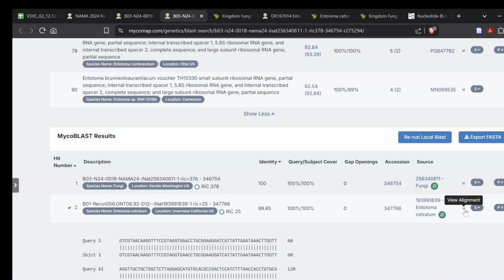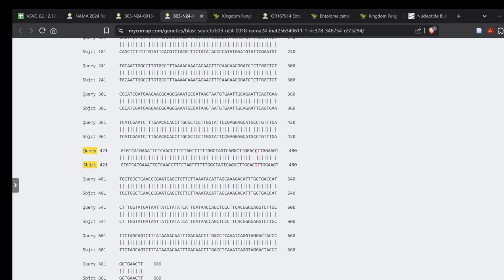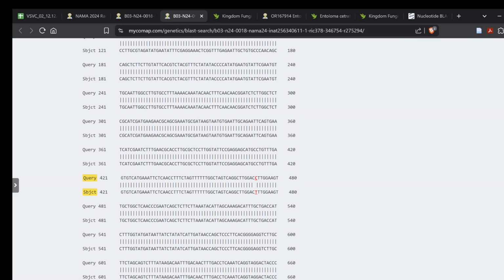Remember when we saw there was this difference in all of them here? Well, I'd bet that the reason there's a difference here is because in our sequence, you actually have both a C and a T. So one way you can look for that is you can copy, I don't know how many that is, 10 or 15 letters, and right after that is the letter you want to look at.